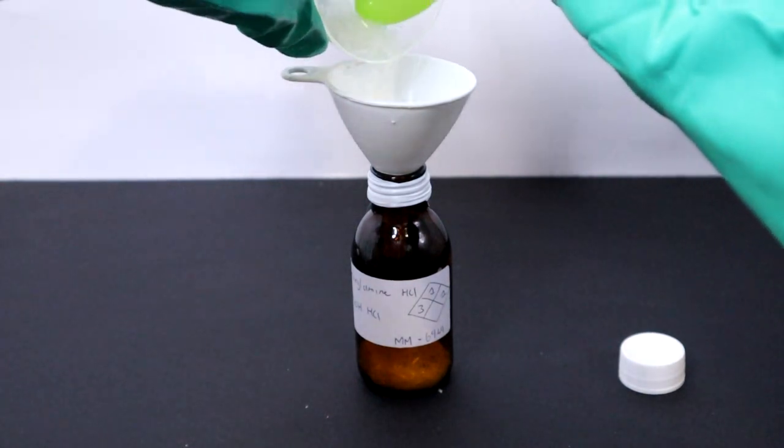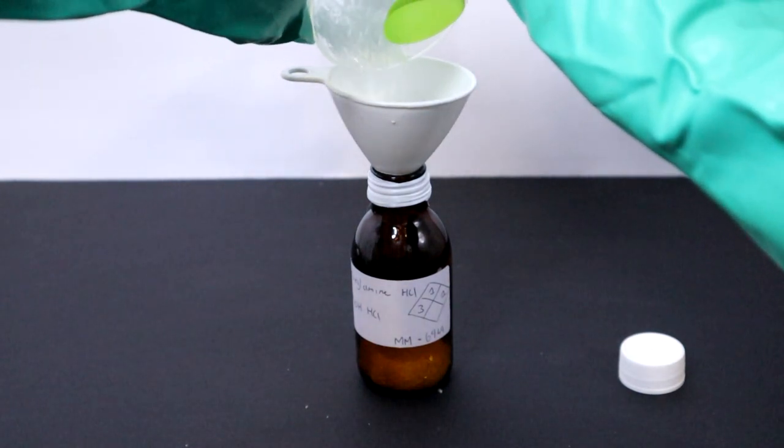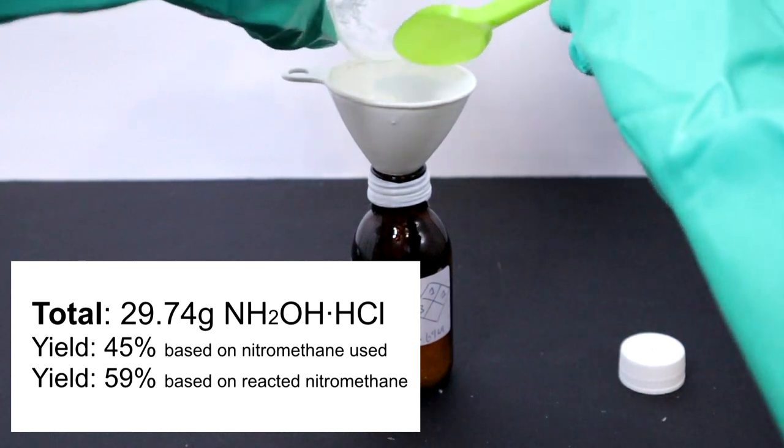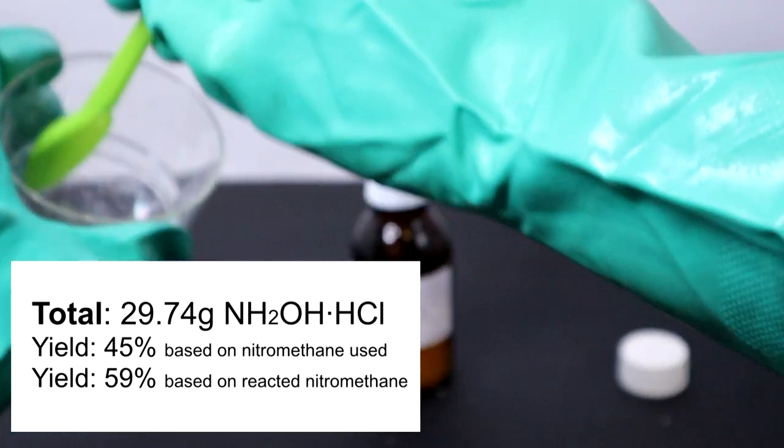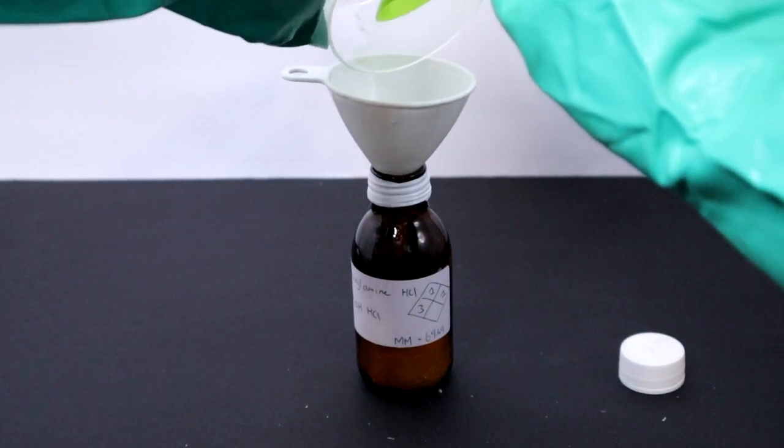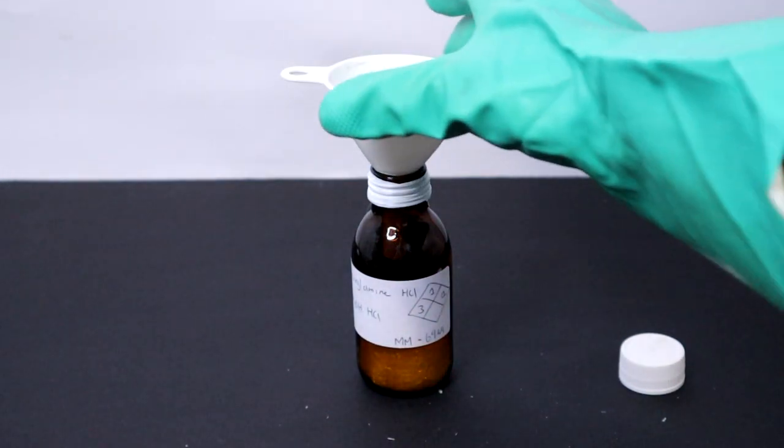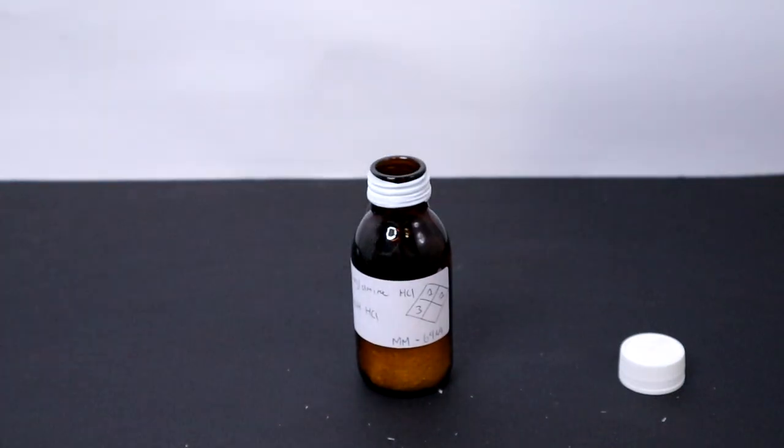The total hydroxylamine hydrochloride obtained from the procedure amounted to 29.74 grams, corresponding to a 45% yield, but a 59% yield based on the nitromethane consumed in the reaction. The recovered nitromethane can definitely be reused in another run if required.